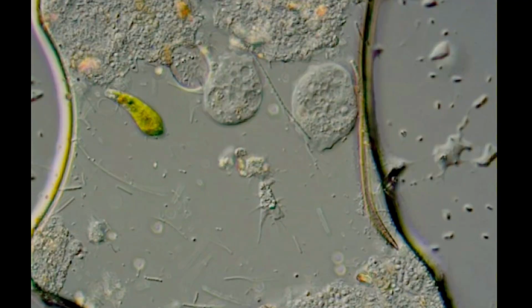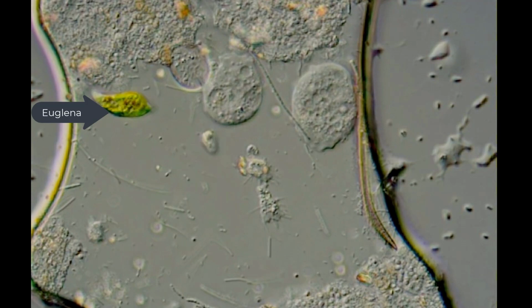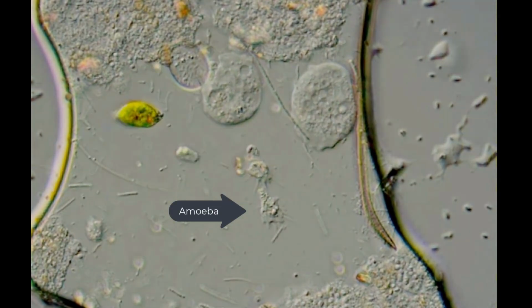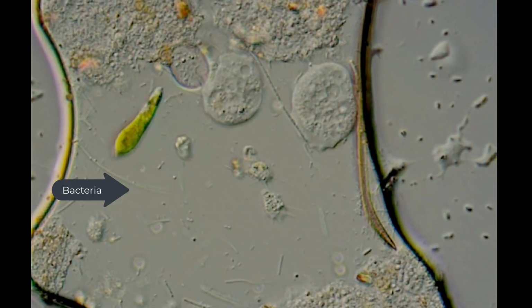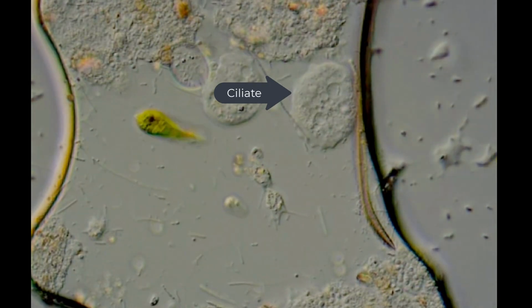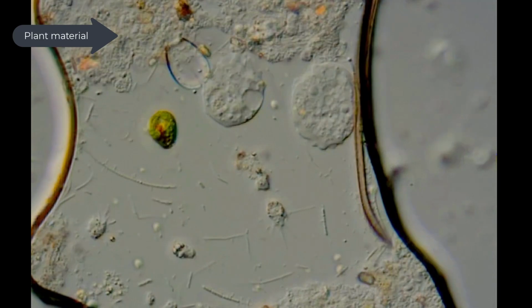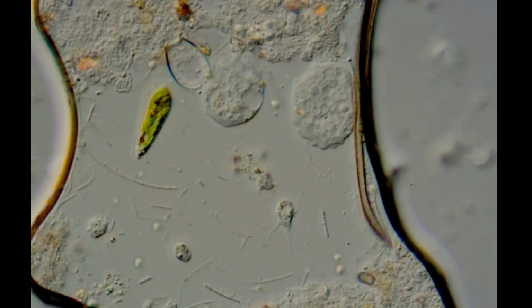You would never think that there's such a variety of different organisms in this little drop of water. That's why the module is called Life in a Drop of Water. And you can see different ciliates in there. You can see a euglena. You can see some other little critters. You can see bacteria. And again, this is a small drop of the sample I've just taken. So happy hunting, and I think there's lots of cool things.